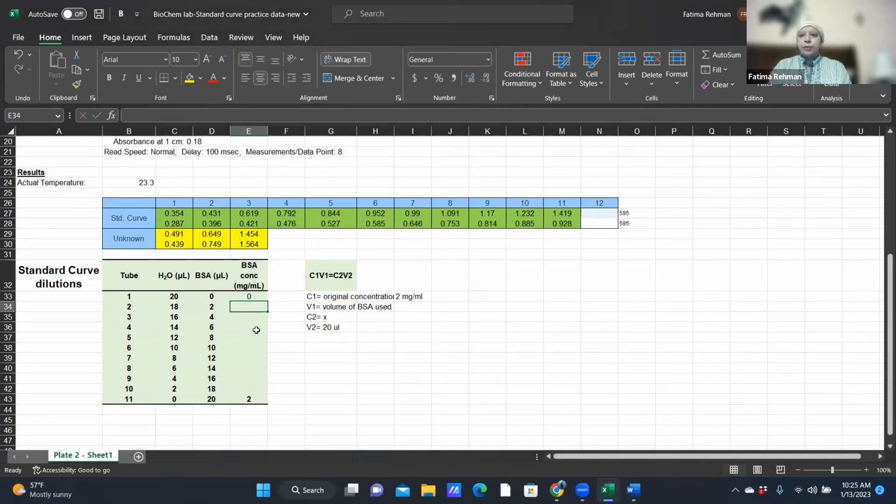Anyone finished doing tube 2? Once you do 1, it should be easy. You can even use Excel to do it. Just create a formula for it. We could solve for X like this. Let's actually make a formula together. That might be more fun.